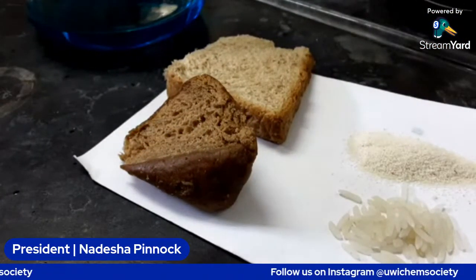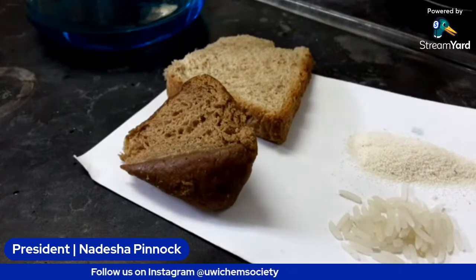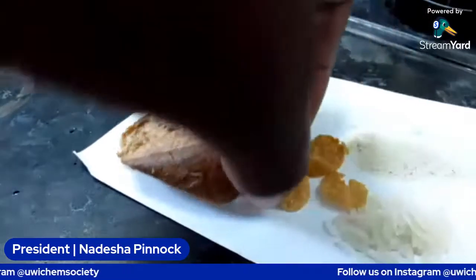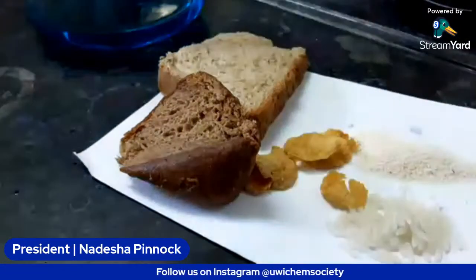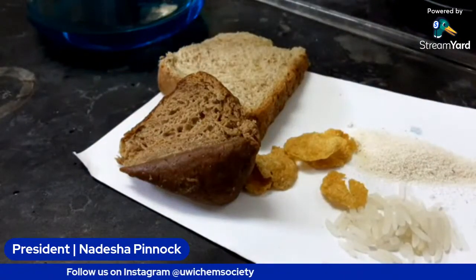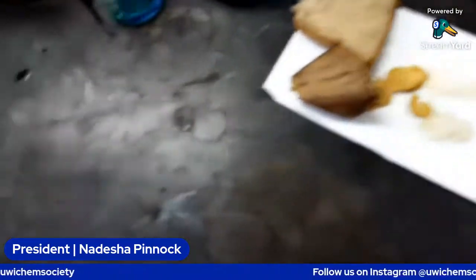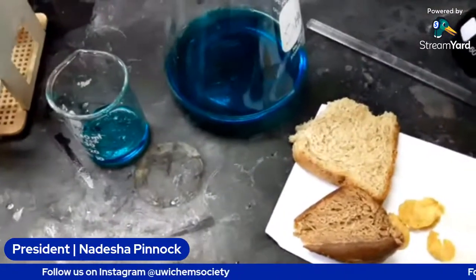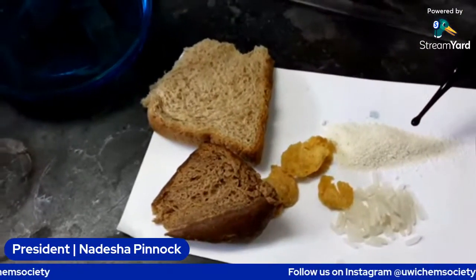I think I had cornflakes as well. So let's add that to the dinner table. Right there. Lunch is served. So we're just going to add about a ml, or a couple of drops actually, of our reagent right here to our samples. So let's do the cereal.